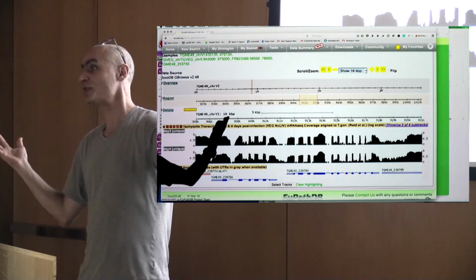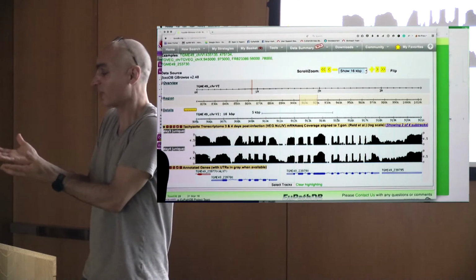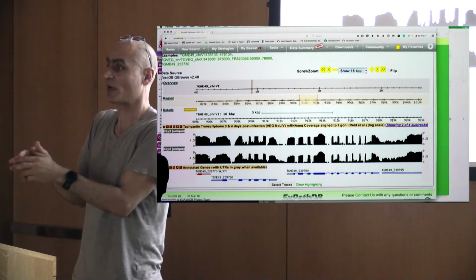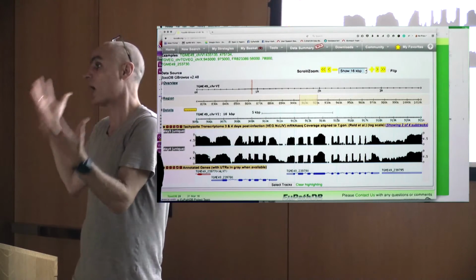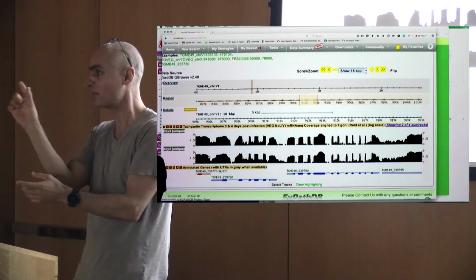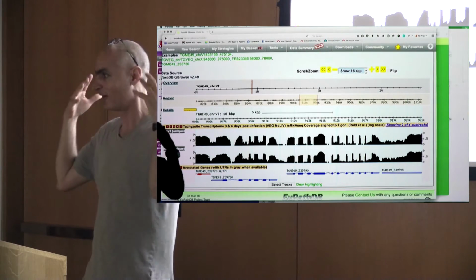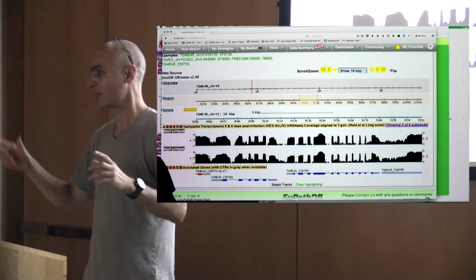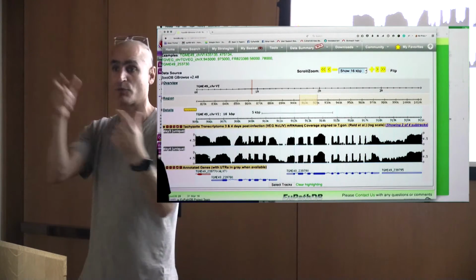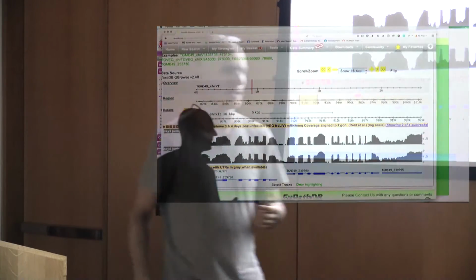Of course, it'll take you years upon years to do that, because some of those RNA sequence experiments give you on the order of 100 million reads. So those are 100 million little pieces that now you need to match up to the genome somehow. Luckily, we have computers with big processors which can align them and look for their matched pair, where they belong in the genome.